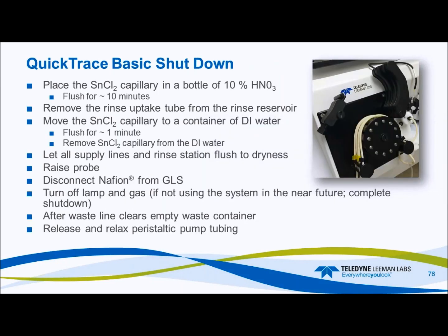Shutdown, a little bit about the shutdown. So basic shutdown, you place your stannous chloride capillary in 10% nitric. We want to rinse for 10 minutes, remove the rinse from the rinse reservoir, so we want that section to run dry, on the autosampler pump.